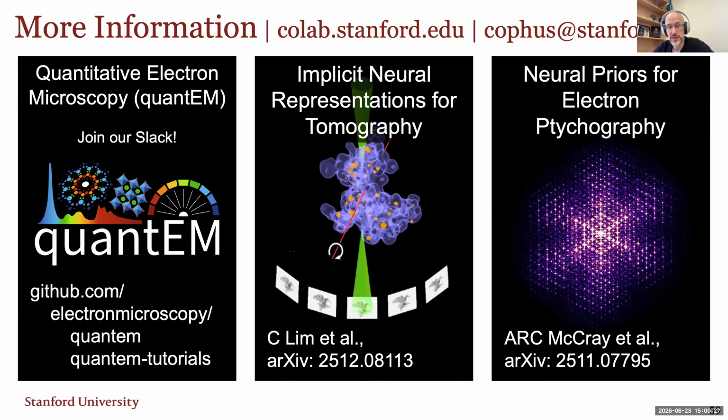But the first part of this question, the deep prior pre-trained on a per sample basis, I should be very clear about this. I didn't emphasize it. This is talking about self-supervised machine learning with a new network trained for every data set, for every reconstruction. We have found that self-supervised machine learning absolutely destroys supervised machine learning in almost every application. And so we've switched from supervised ML in almost every project we do to these self-supervised neural networks trained on every individual sample.